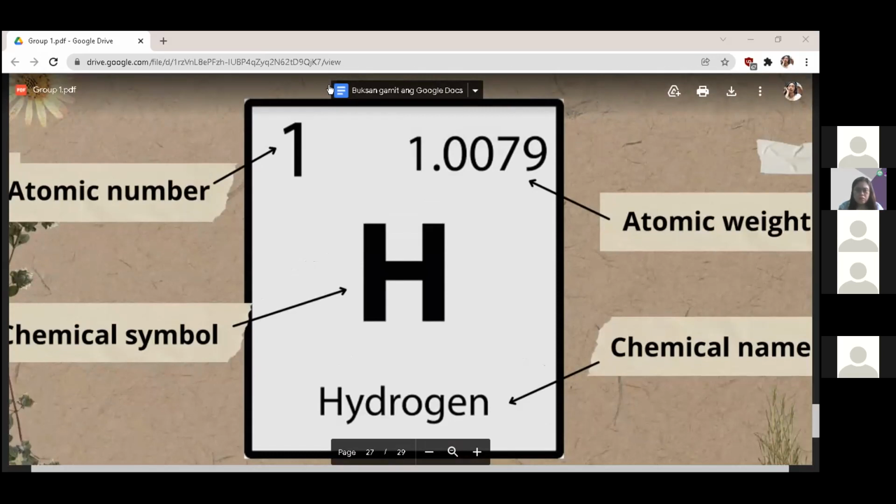In this activity, we have learned about different laboratory apparatuses, their uses, and what they look like. We also learned about their benefits and importance in the laboratory because of their unique abilities and different uses of every apparatus used in analytical chemistry.